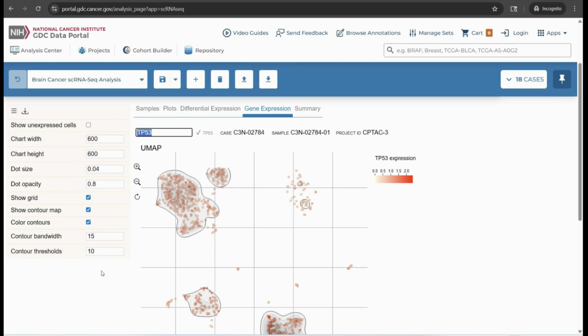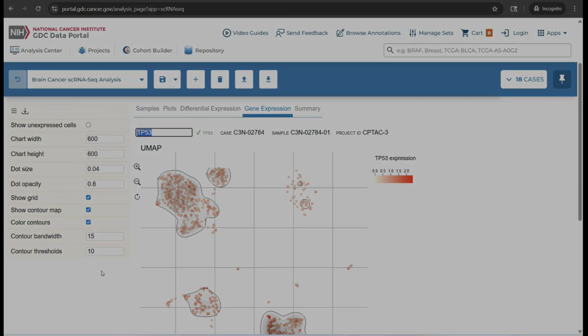Population transitions are apparent when there is gradual contour spacing. This highlights regions between distinct clusters and reveals subtle biological state changes. Rare populations can be identified when there are sparse contours. This indicates low-density regions, helps locate isolated cell populations, and distinguishes rare cell types from artifacts.